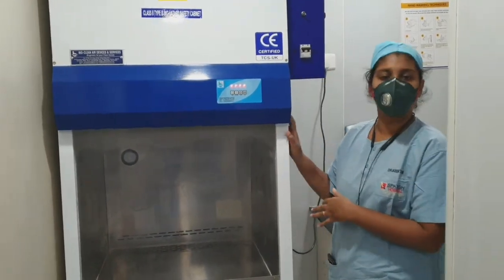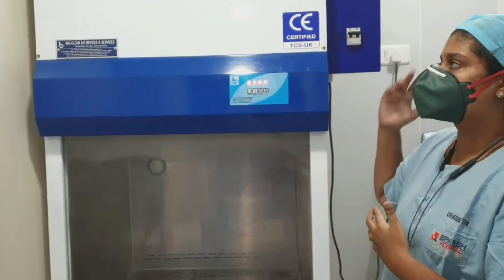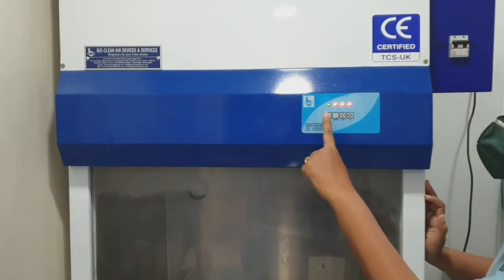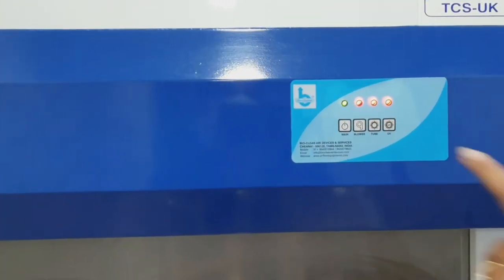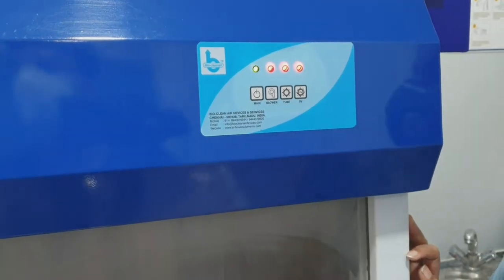This is the chemotherapy hood or the laminar hood. We will see how to turn it on, how is the exhaust and how is the inlet. This is the main button. You have to turn on the main, and this is the blower, this is the tube light, and this is the UV light.